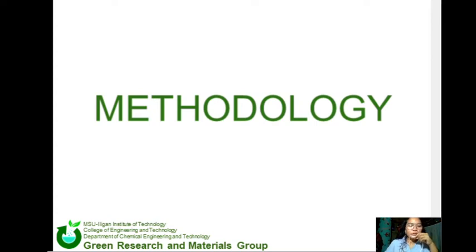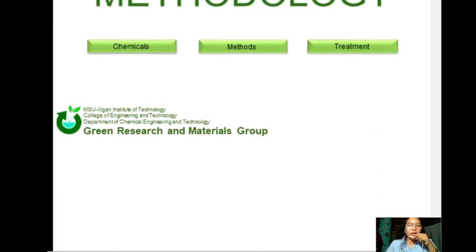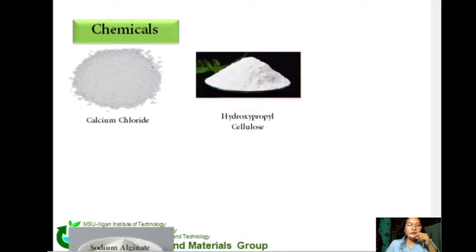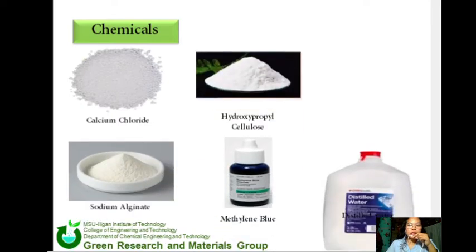In this section, I will be discussing the chemicals, methods, and treatments that we'll be dealing with. The chemicals to be used are calcium chloride, hydroxypropylcellulose, sodium alginate, methylene blue, and distilled water.